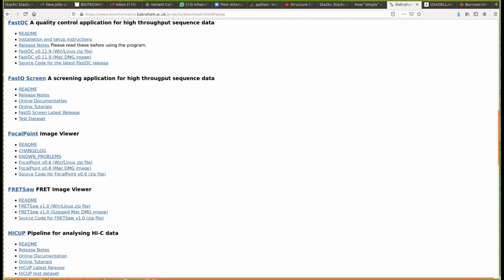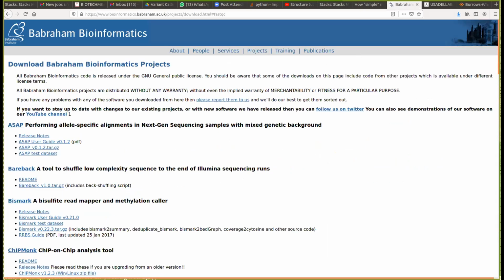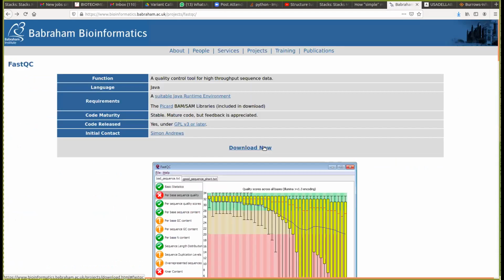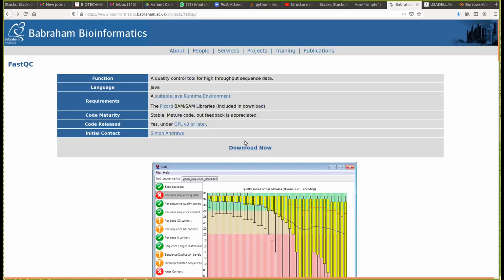So see, you open the link which I have given for the FastQC software. On this link, you will get the option of downloading this software. This can also be done by those who have Windows on their system. Once you download this, let me know so that I can proceed with the next steps. Those who have Linux can use this version, and on Windows the same version will be installed. Once it is done, let me know so that I can explain how to go to the next step.